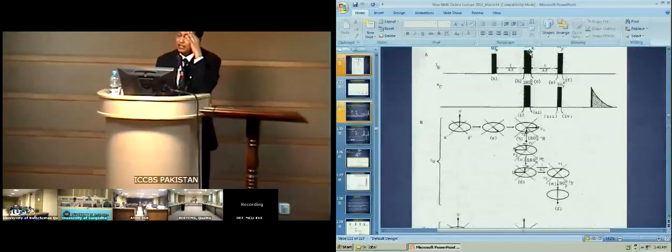One is a spin echo pulse, the other one is a spin inversion pulse. So they are given exactly at the same time. This is also at the same time. This adds a magnetization vector, polarization to the carbon, and right at that time you give a 90 degree Y pulse to bring it to the XY plane.